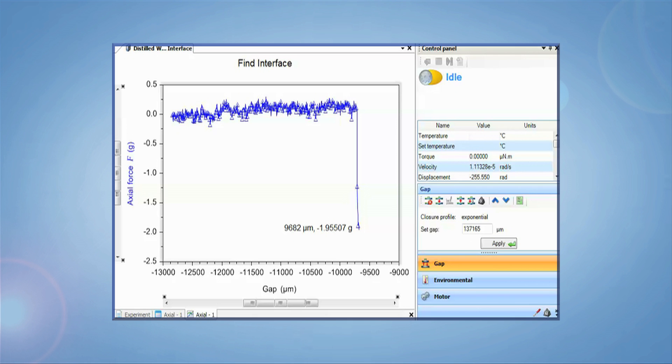Next, lower the ring down by 500 microns. This positions the ring so it is centered at the interface. The axial force should be close to zero at this point.